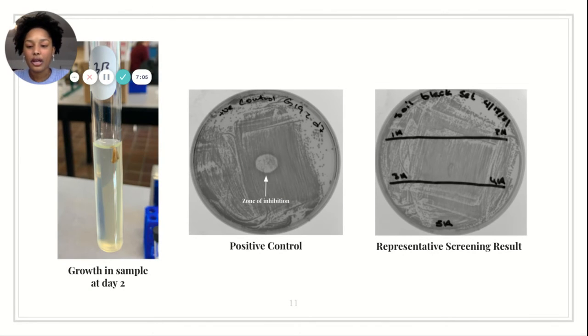The results of this experiment are pretty cut and dry. The positive control, which used an extract from the lab it was analyzed in called G192, showed a zone of inhibition. None of the other 120 screening results, on the other hand, did. There are a plethora of possible reasons that results from the aliquot analysis show no antimicrobial properties. S. aureus is a gram-positive bacteria, and it is possible that the aliquots tested produce natural products that target only gram-negative bacteria. It is also possible that the aliquots secreted natural products that affect a narrow spectrum of bacteria, and S. aureus is not one of them.